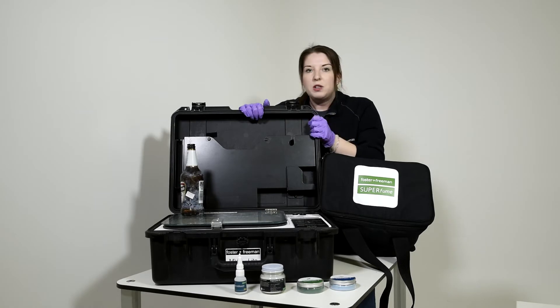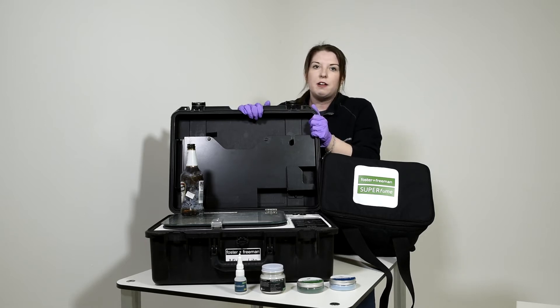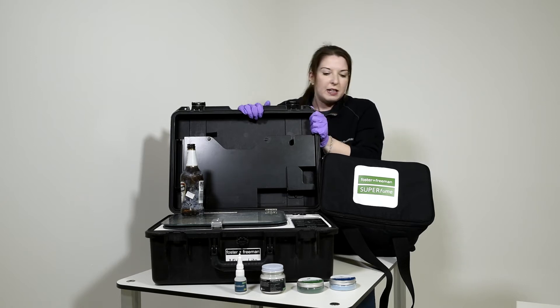FP Natural Powders might also be useful when you're working in covert operations or covert situations where you need to go into a scene very quickly, powder, image, and then leave the scene.